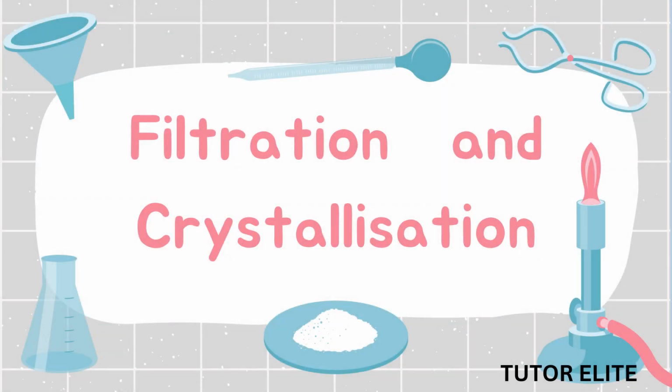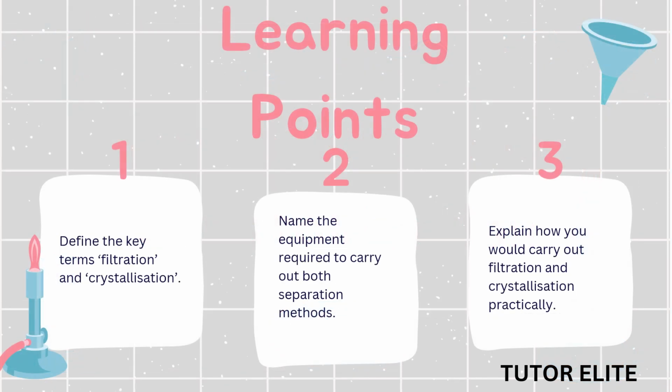Tutorial. Today's topic is filtration and crystallization. So basically what we learn in this filtration and crystallization, we'll see the definitions of these terms, then the equipment used for different types of separation methods, and the third is explaining how to carry out the filtration and crystallization practically.